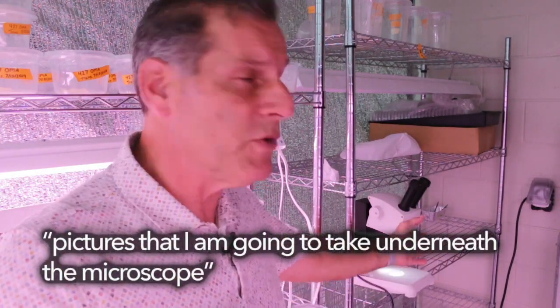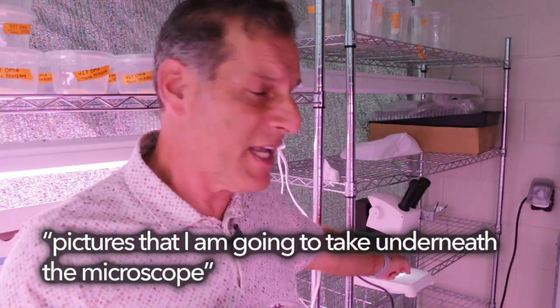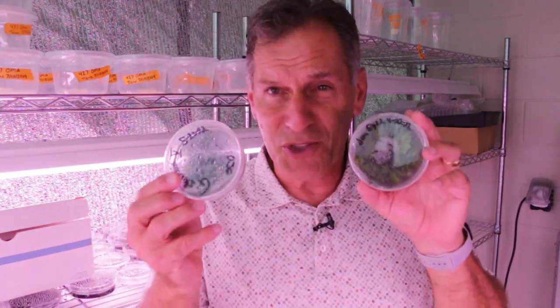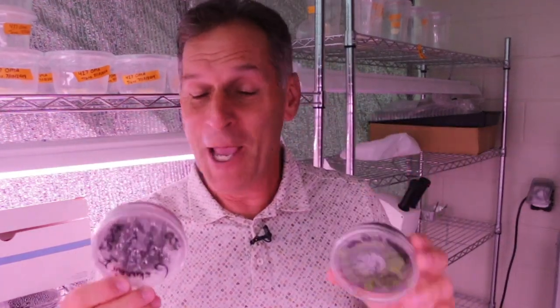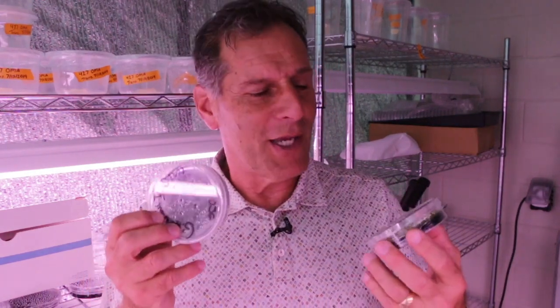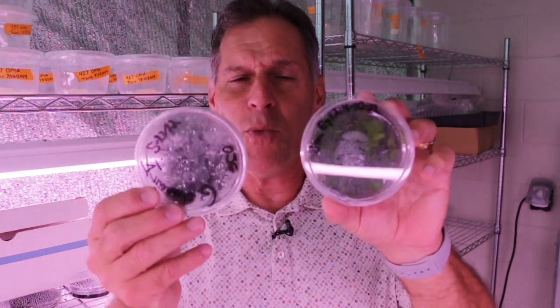When you look at the seeds underneath the microscope, I'm going to show you a picture. This scope isn't set up for image capture, but I have another scope that is. Some things you can't see here or with the naked eye very easily, so I'm going to do image capture underneath the other scope and insert those images into the video as we move forward.